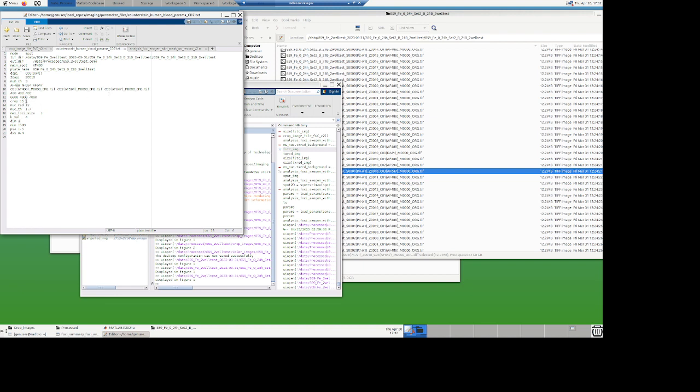Okay, crop 15, that's a new parameter. I just coded it, so hopefully it won't crash on me. But that basically says how many pixels I typically crop each nucleus based on nuclear segmentation. Instead of cropping exactly on the boundaries of the mask, I do a dilation of the mask just to get a bigger size, and that's what that is. So I'm putting a 15 pixel boundary.